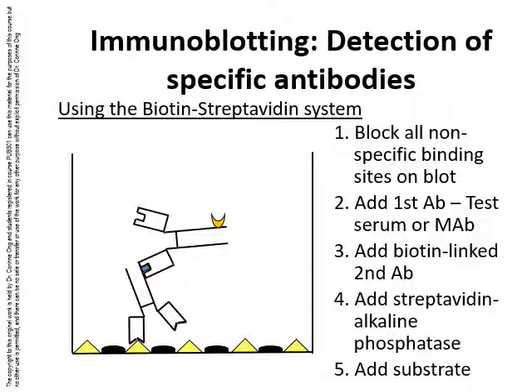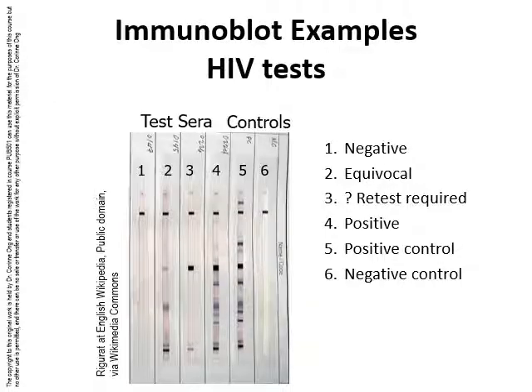This is usually an anti-serum like anti-human IgG or IgM, and this second antibody is usually conjugated with a chemical such as biotin, which binds specifically to another chemical called streptavidin. Once again, the blot is washed thoroughly to remove any unbound second antibody. The next reagent that is added is the streptavidin conjugated enzyme, which will bind specifically to the biotin conjugated second antibody if it is present. In the final step, the enzyme substrate is added, and any proteins that are viral antigens will show up as dark purple bands.